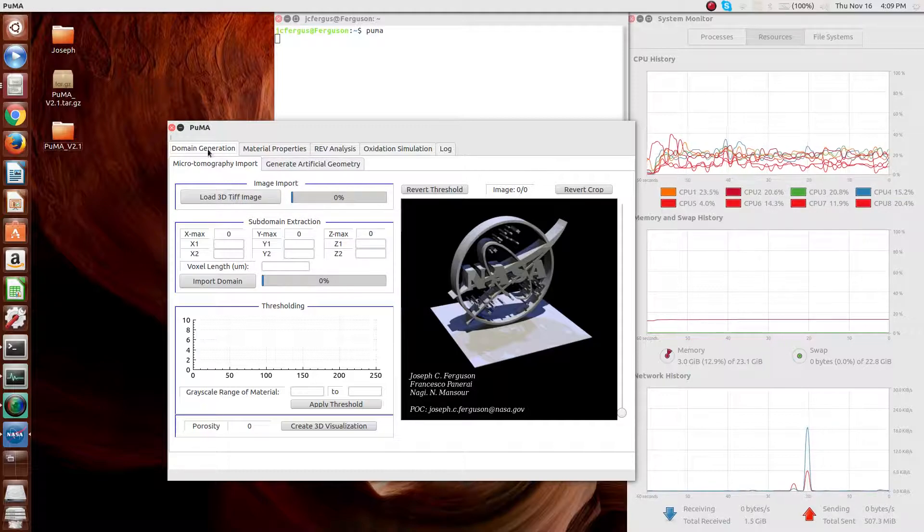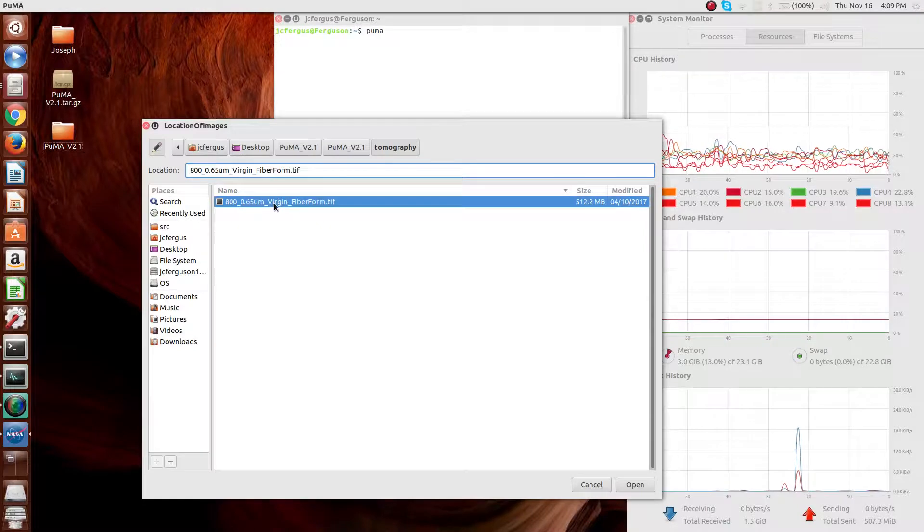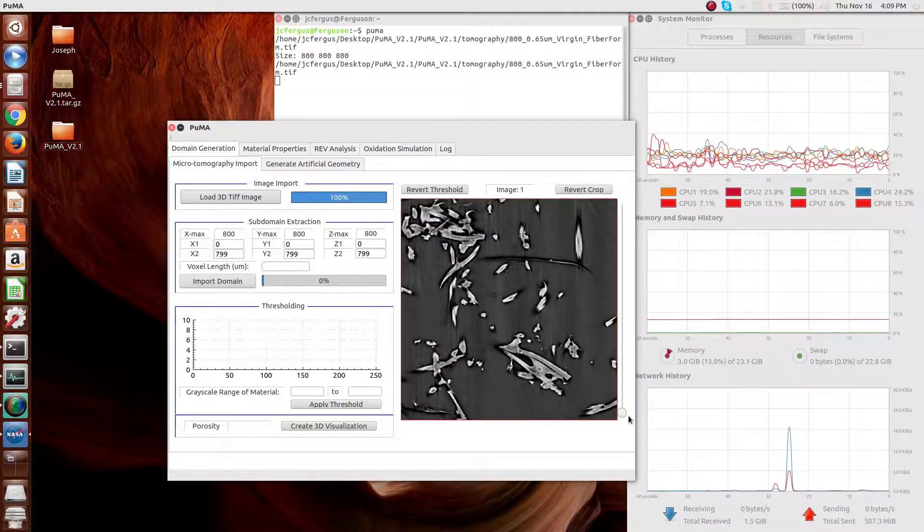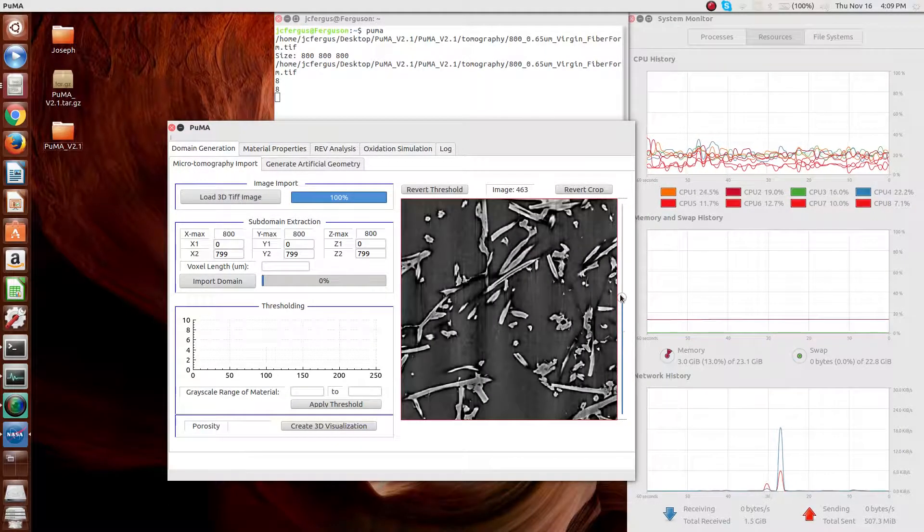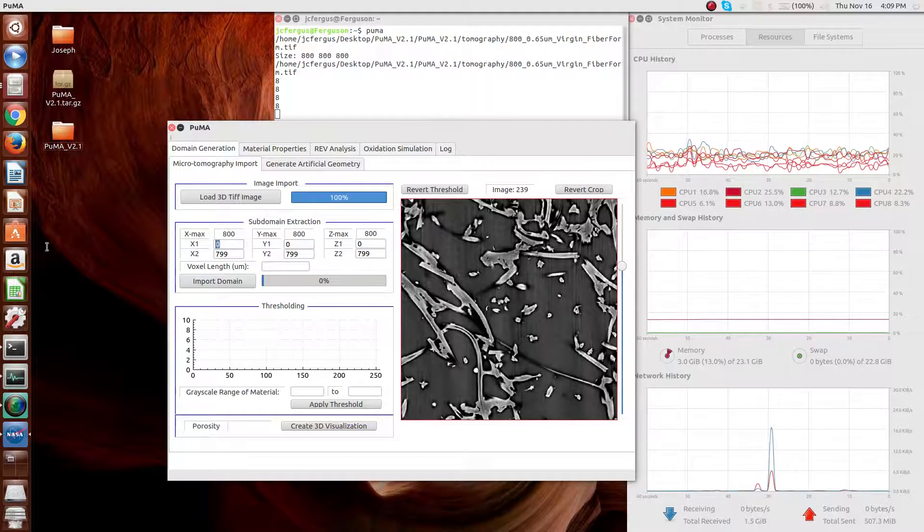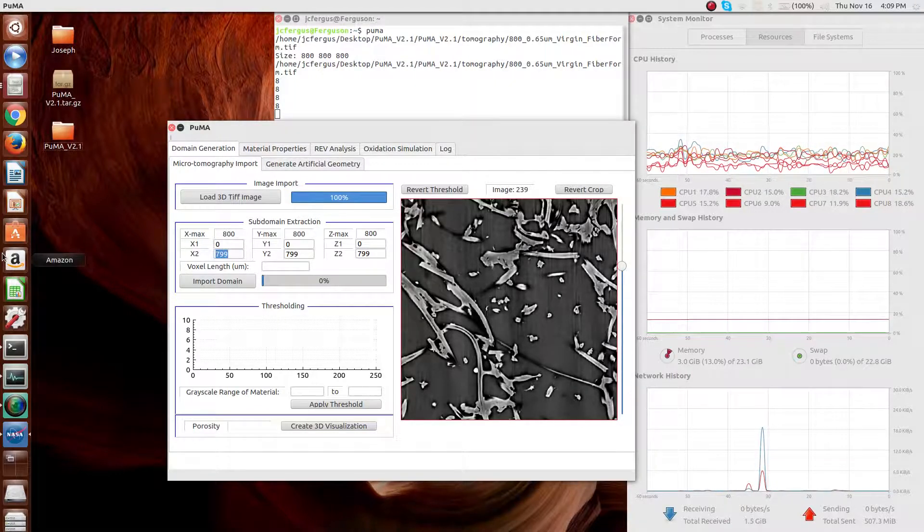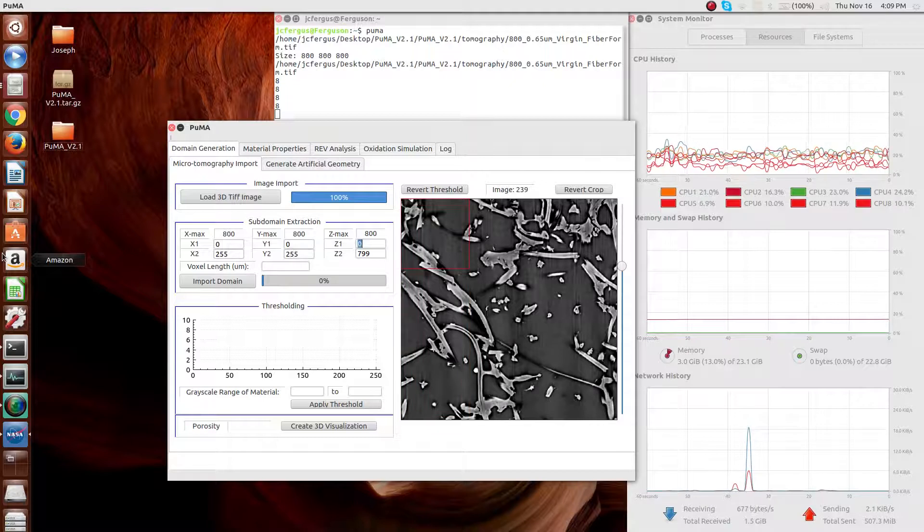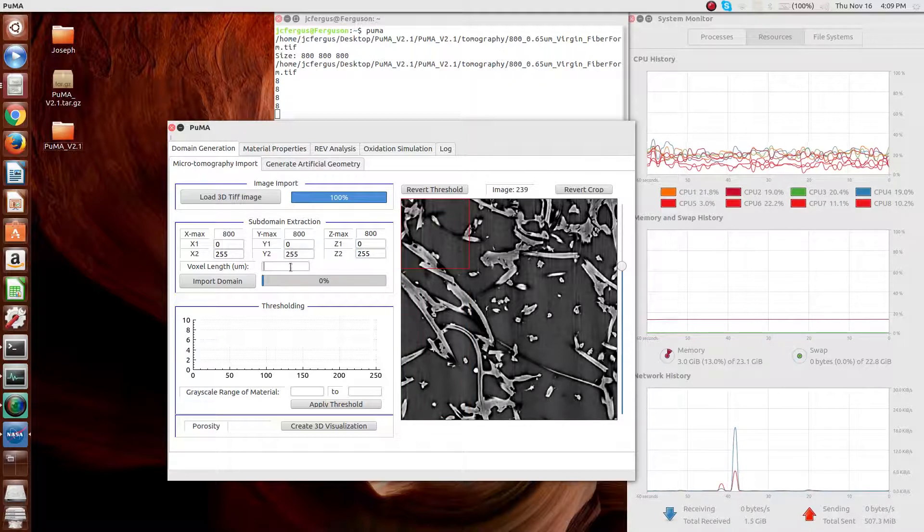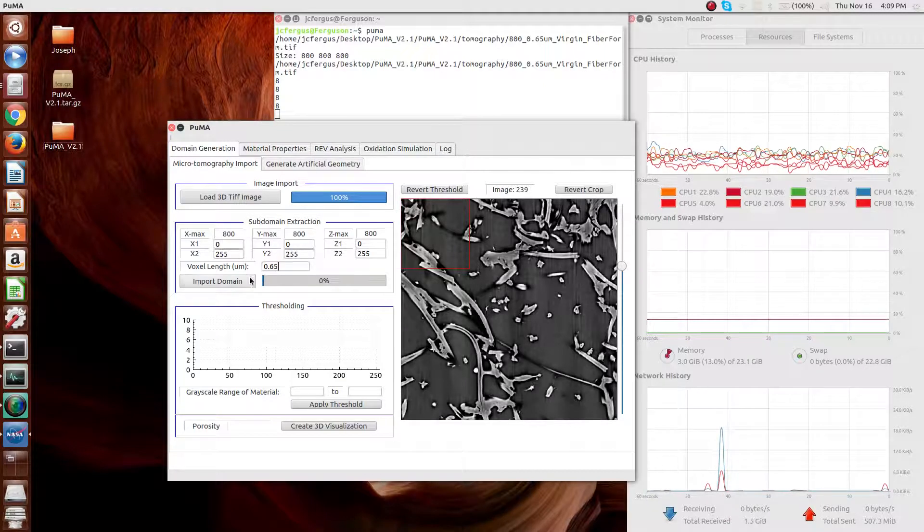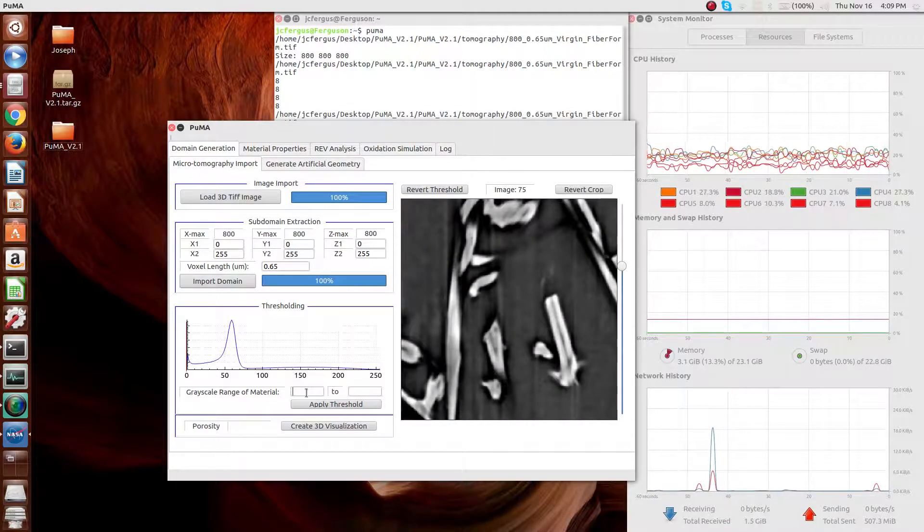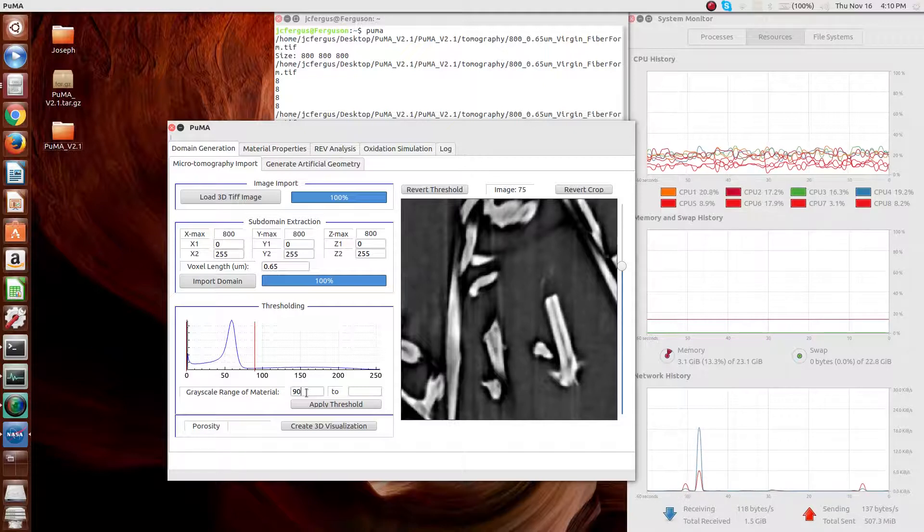For microtomography import, you can import a three-dimensional TIFF image, shown here as TIFF stacks. Select a subdomain for analysis. For the purposes of this overview, I'm going to select a very small sample. Select the appropriate voxel length and import the domain.